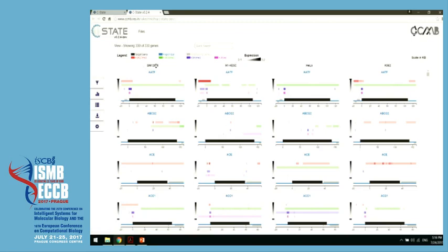So here, the data of each cell type is arranged vertically. You can see that there are columns, and this title explains which cell type it belongs to. All of these are human cell lines. You have embryonic stem cells, GM12878, which is a blood cell, HeLa, everyone knows, and K562.